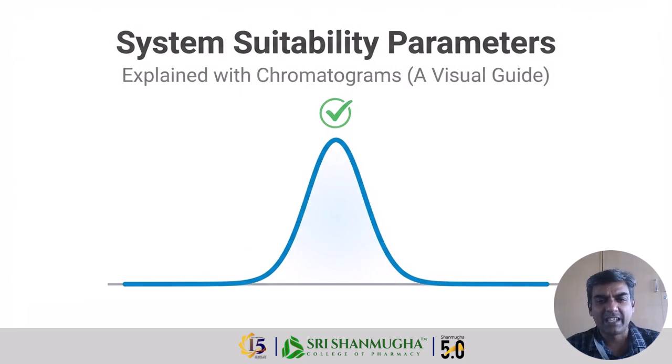And how do we check it? By reading something very important, the chromatogram. So we will see the chromatogram's shape, size, and we will see the quality of the chromatogram, and we can find any fault in the HPLC or not.